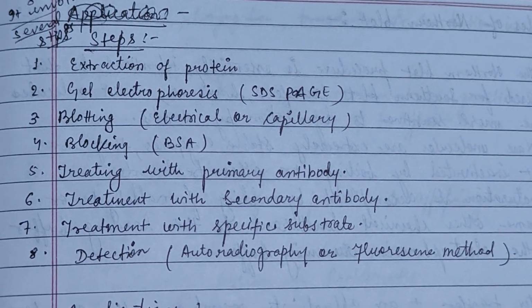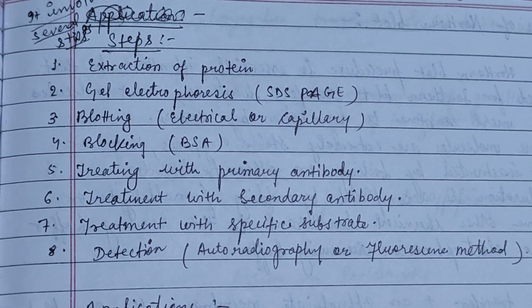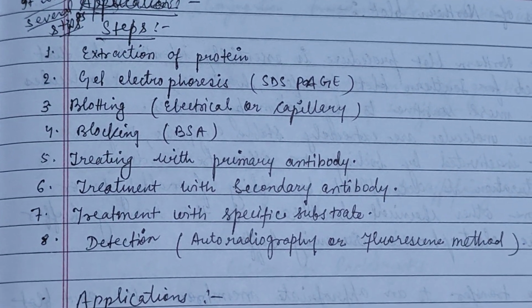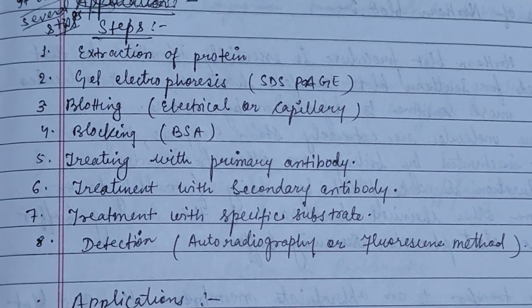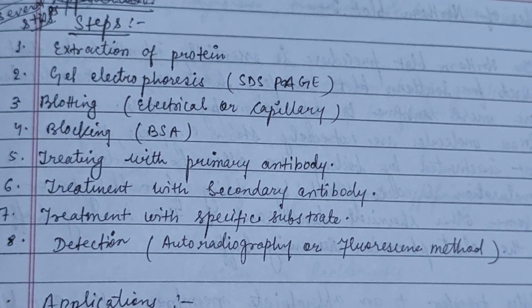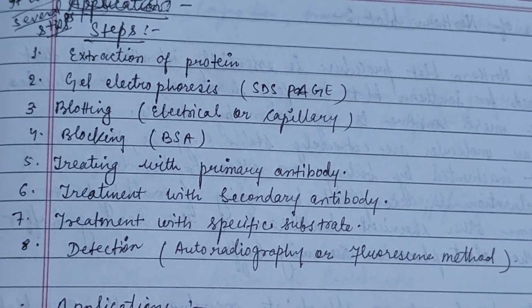Here are the steps of Western blotting. First, extraction of the protein, then electrophoresis in SDS-PAGE, blotting, blocking, treating with the primary antibody, treating with the secondary antibody, and treating with the specific substrate. Then detection is carried out with the help of autoradiography or the fluorescence method.